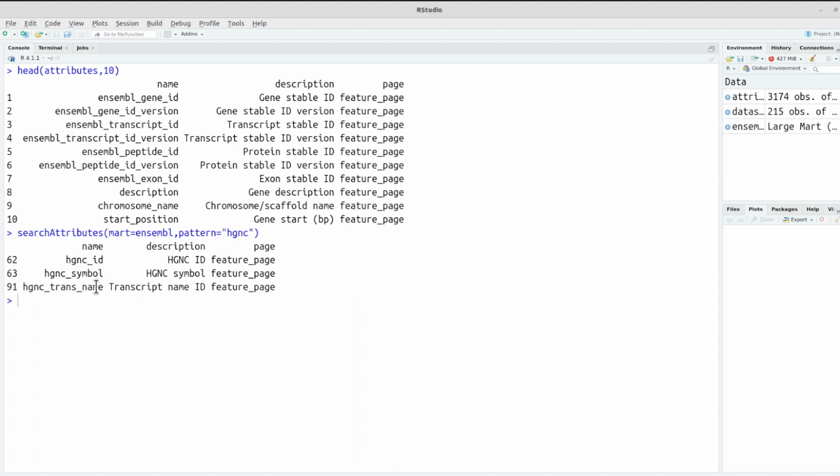So what we are going to do is to convert our Ensembl IDs to this symbol here. Take note of that. With the attributes, you can also get the Ensembl gene ID. We are already using the Ensembl gene IDs, but it's also here. These are things you just have to search and then select the ones that you want. I'm only using this tutorial to introduce you to this R package so that you can take it up from there. So, we will use this one here.